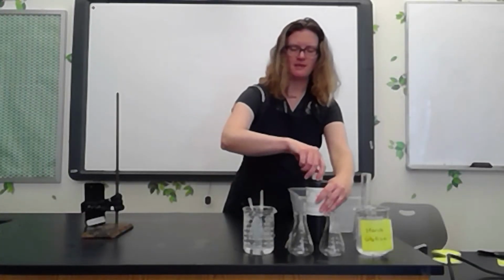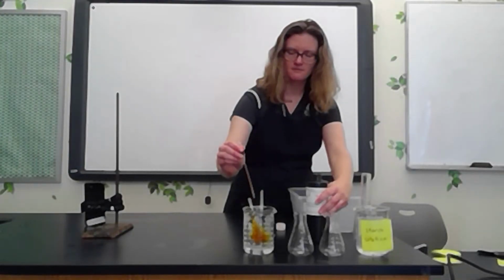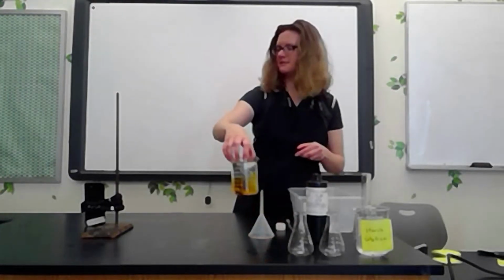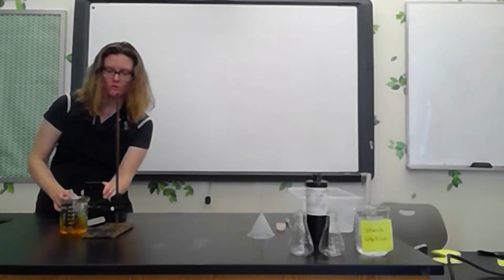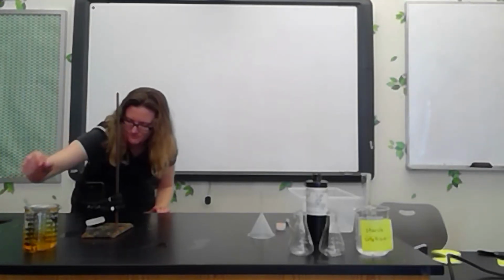And to the outside, so to the environment, I'm going to add a dropper of iodine solution. And then I'm going to put this whole thing in front of my camera so I can record a time lapse. And we can watch what happens over time.